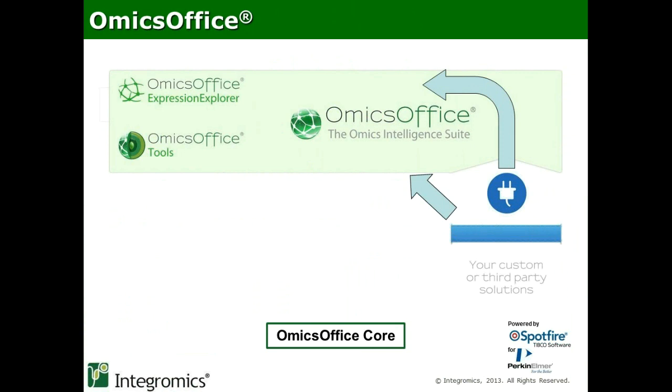This OmicsOffice is running on a business intelligence platform called Spotfire, which has been adopted by many types of industry. And by adding the OmicsOffice capabilities, what we are doing is bringing this business intelligence software solution to the world of biological analysis.